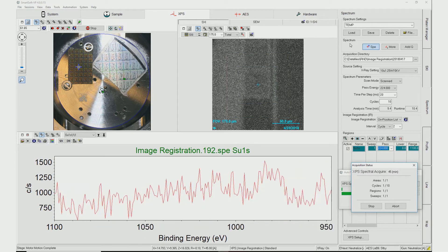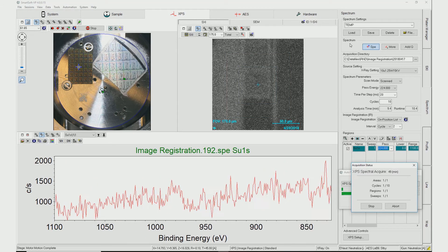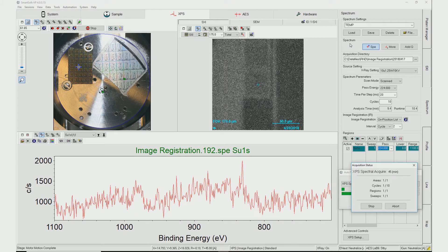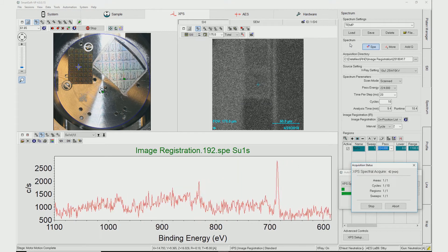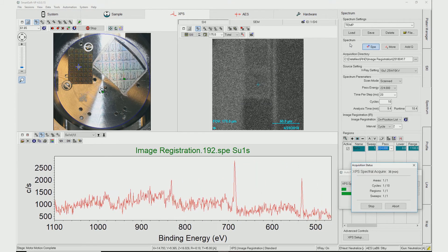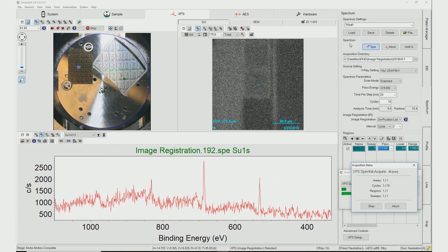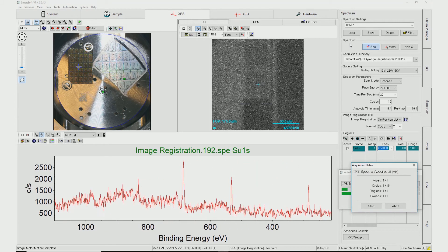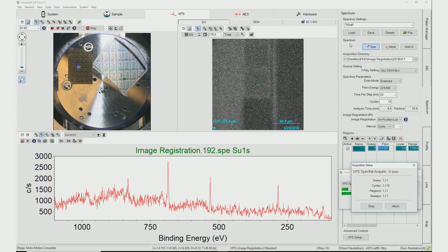Standard PHI analysis features like multiple point analysis, queued acquisitions, and depth profiles can utilize the Image Registration software.